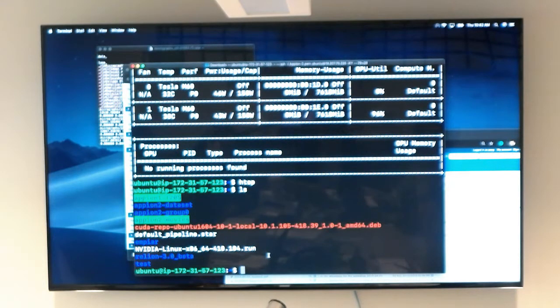So locally you might have better resolution, but other parts might be smeared out. It's not to say they all can't be in the same folder, but if you do that, then you just have to be very conscientious in annotation.